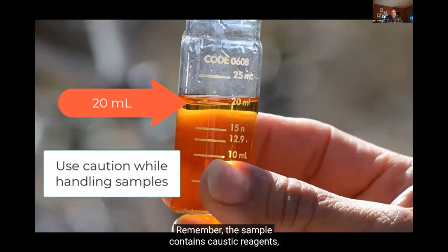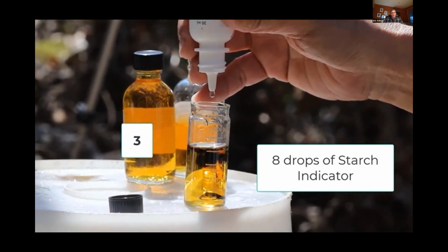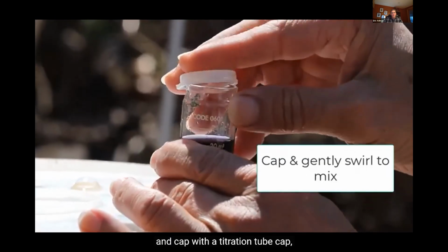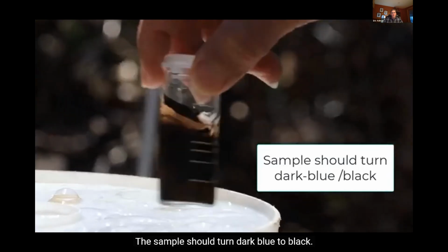Remember, the sample contains caustic reagents, so use caution. Now add 8 drops of starch indicator to the tube and cap with the titration tube cap, which has a hole in the center. Gently swirl to mix. The sample should turn dark blue to black.